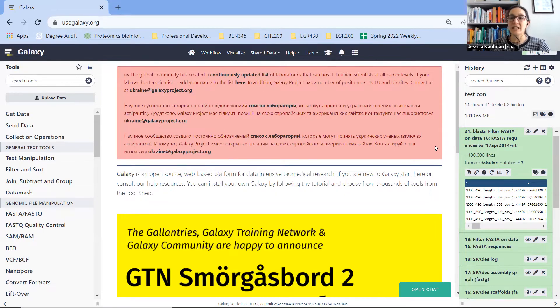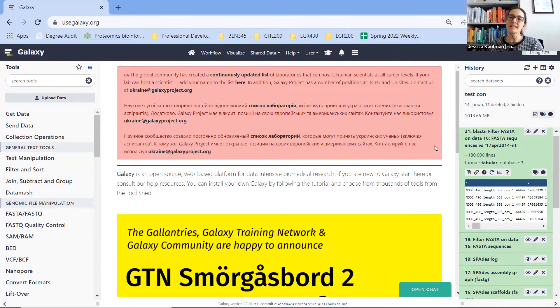Hi everyone. In this quick video, I'm going to show you how to deal with Galaxy BLAST results. You may end up with a really big file that's hard to scroll through, and this is an easy way to sort it in a spreadsheet.